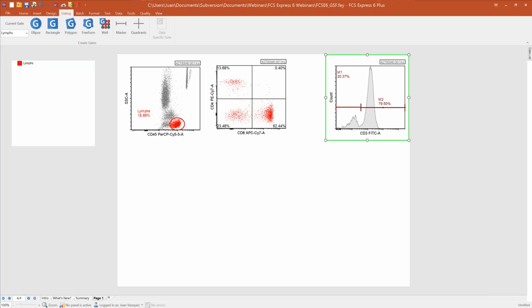What I can also do is I can drag stats onto an endpoint, or I could drag one marker on top of another marker from another plot to link them together. So that way if they moved, they'll also move, similar to how we've enabled linking the quadrants together in the other plot. Okay.